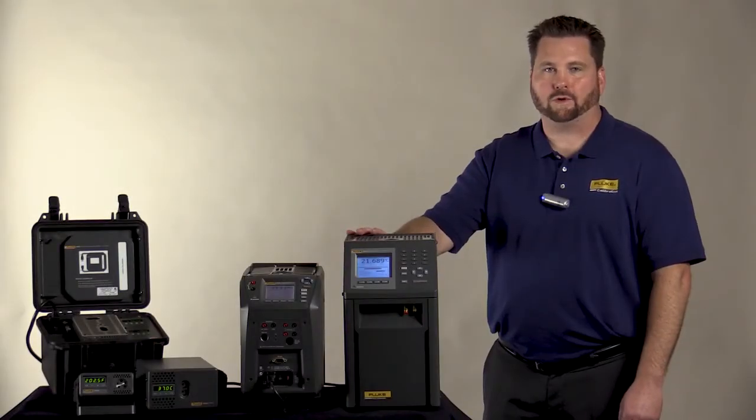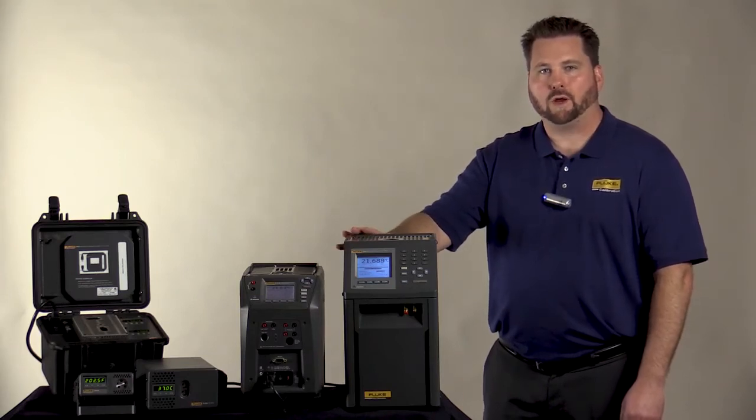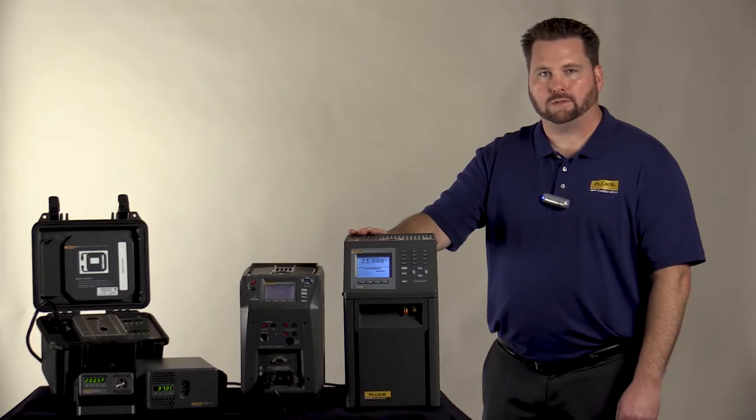Hi, Travis Porter with Fluke Calibration. Today I'd like to show you our family of drywell calibrators. A drywell calibrator is a stable heat source that allows you to create and maintain a consistent temperature with a known accuracy.